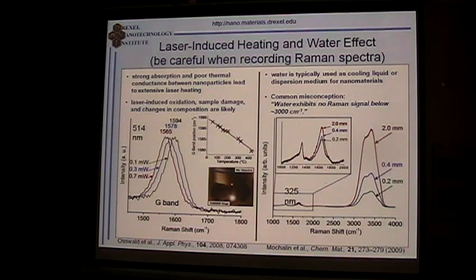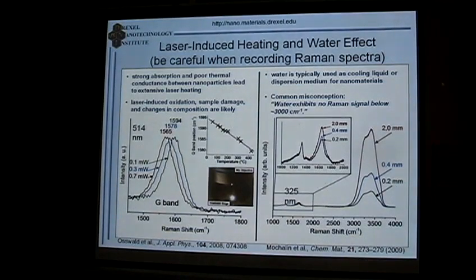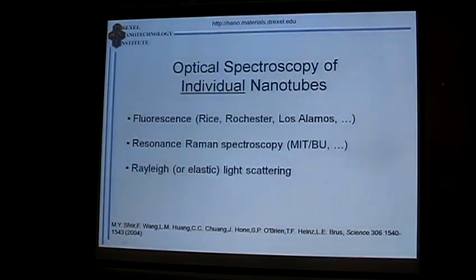You need to check that you don't burn your sample, you don't heat your sample, and that you don't shift your peak as you study and measure spectra one after another for a long time. Only then can you get really useful scientific results here.